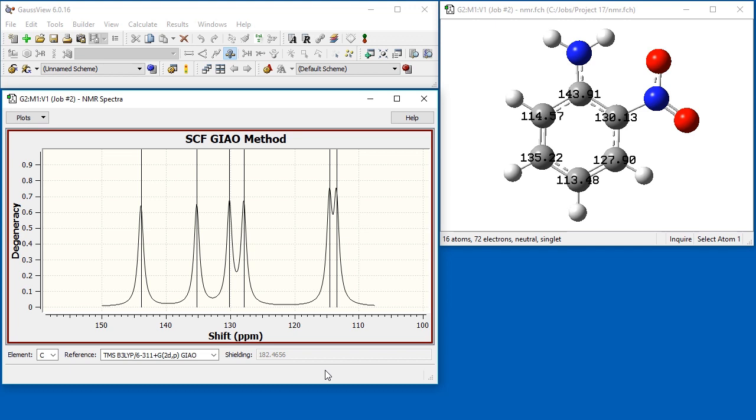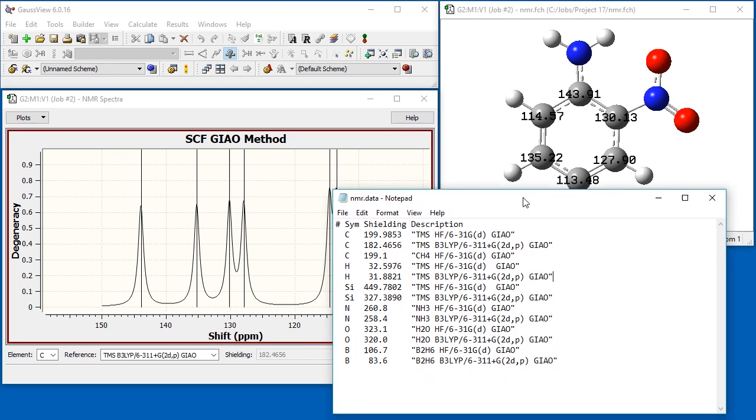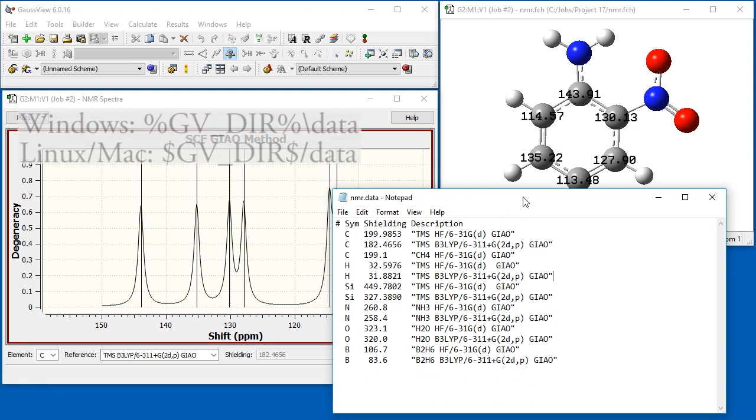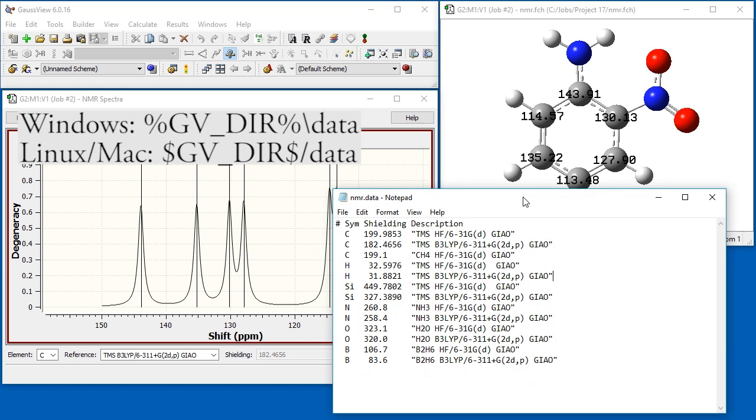Of course, you need to use the same model chemistry for calculations on the reference molecule, like TMS, and for your molecule of interest. Once you've computed them, it is quite easy to add additional items to the set of available references. This data is stored in a text file named nmr.data, which is located in the data folder under the main GaussView directory.